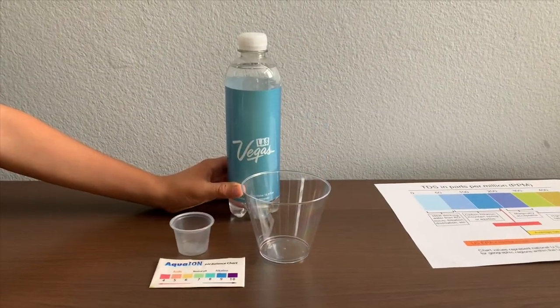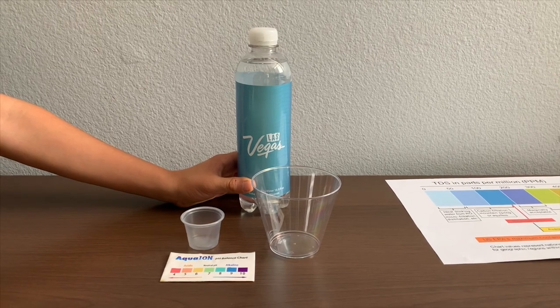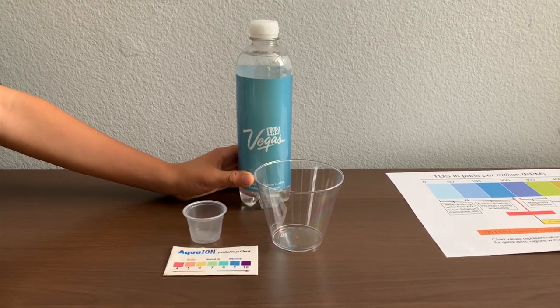This is Las Vegas Purified Drinking Water Enhanced with Minerals. It is sourced from municipal sources. Let's test the pH and TDS levels.